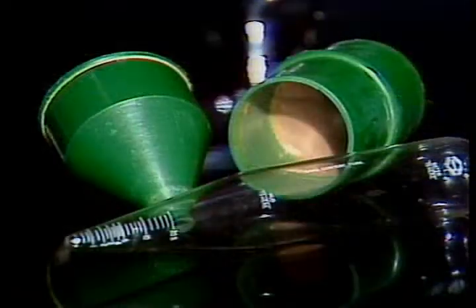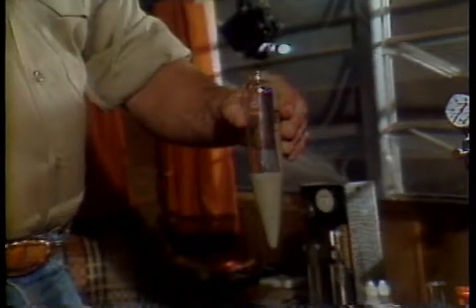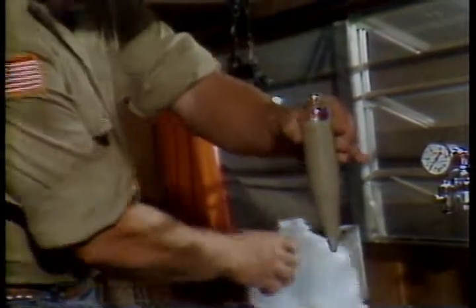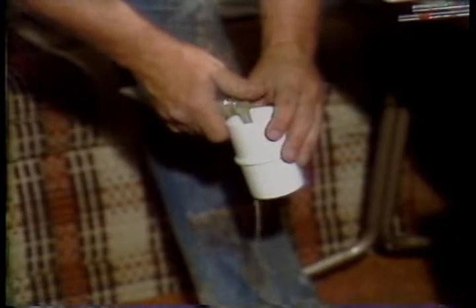Another test he'll do is a sand content test. Basically, this test just tells him how much sand is being retained in the mud. I'll pour a quantity of mud into the sand content tube up to a line where it says mud. Now we'll fill it up to the water line. And now we'll mix the mud thoroughly by shaking it. We'll run it through our screening device. Now let the mud filter out, leaving the sand.